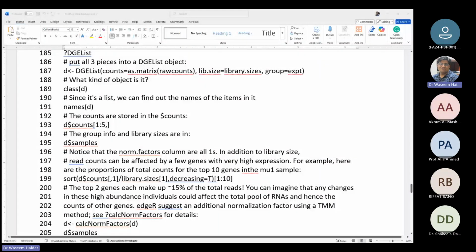Miss Sadia Momal. Yes, you can see that. Where is my screen? उस पे आ रही है. आ रही है? किस पे आ रही है? Okay, so what you can see in the screen, you can see the R codes. क्या दिख रहा है आपको?